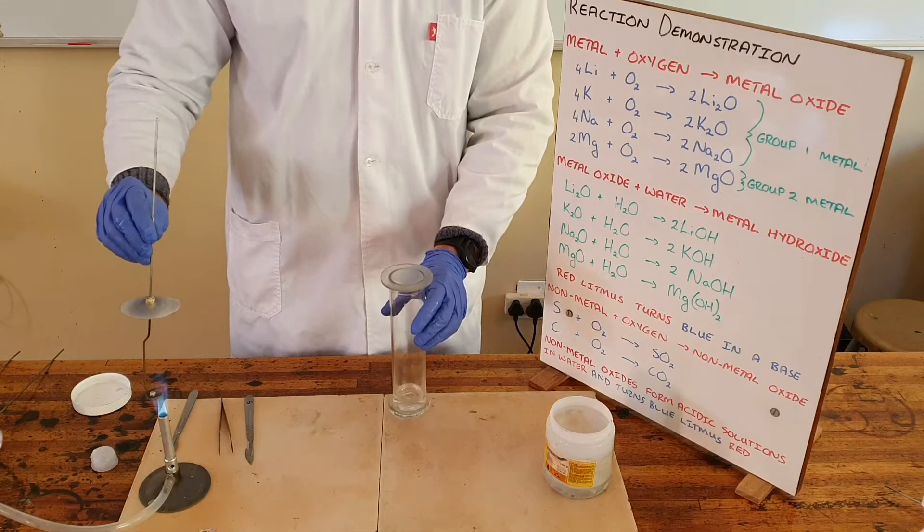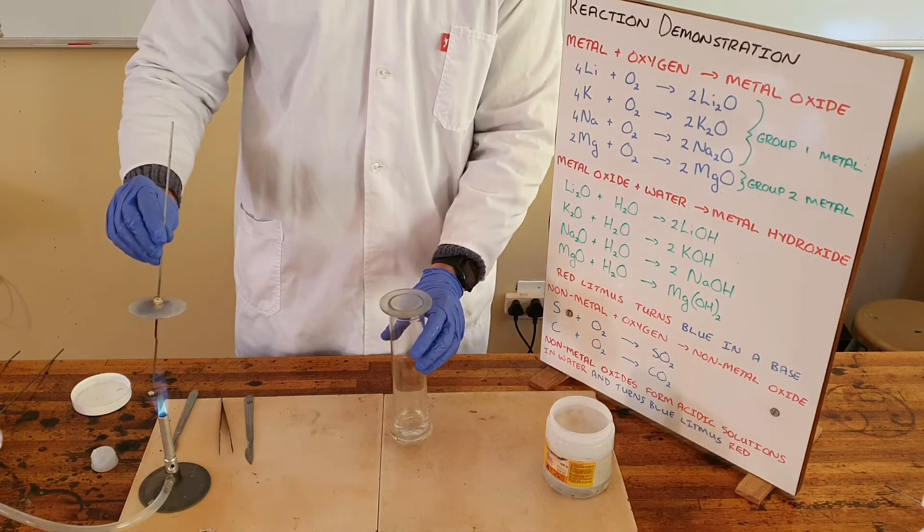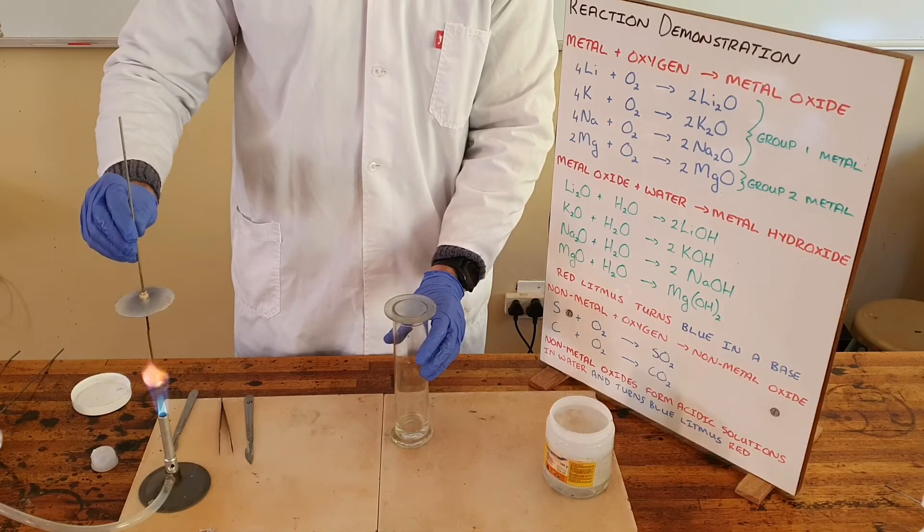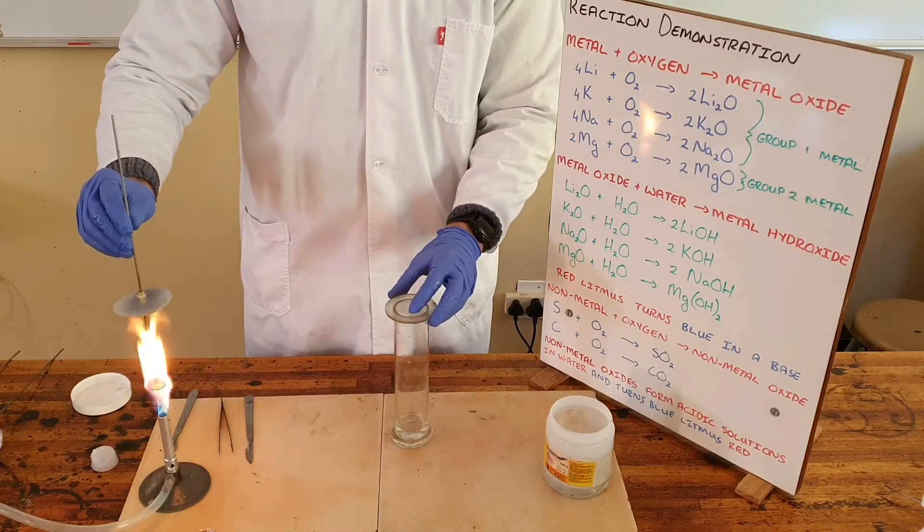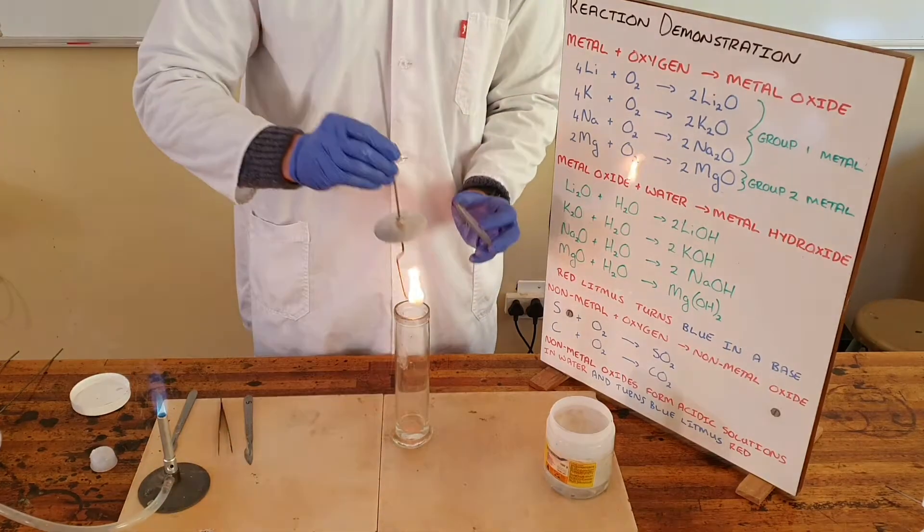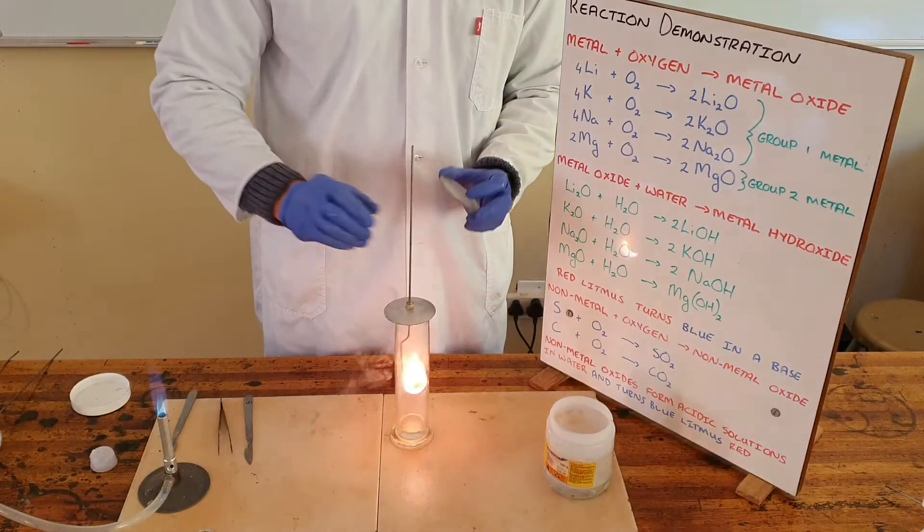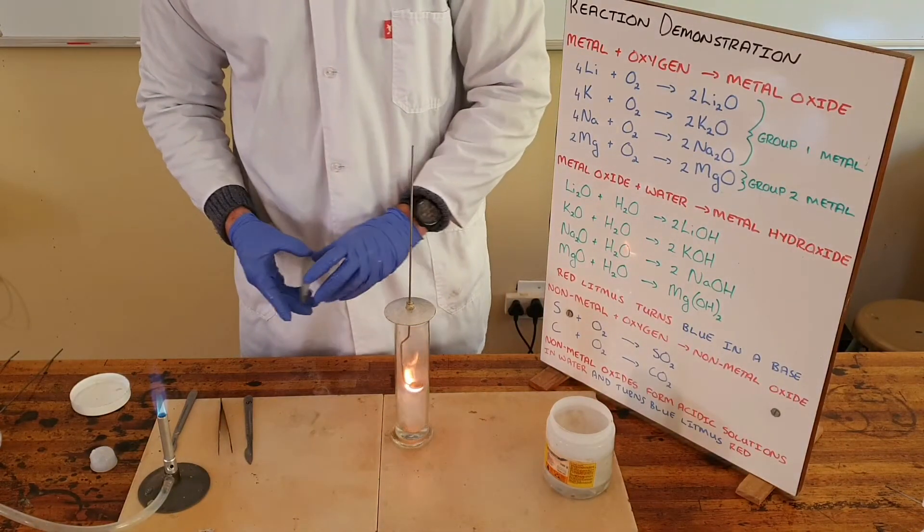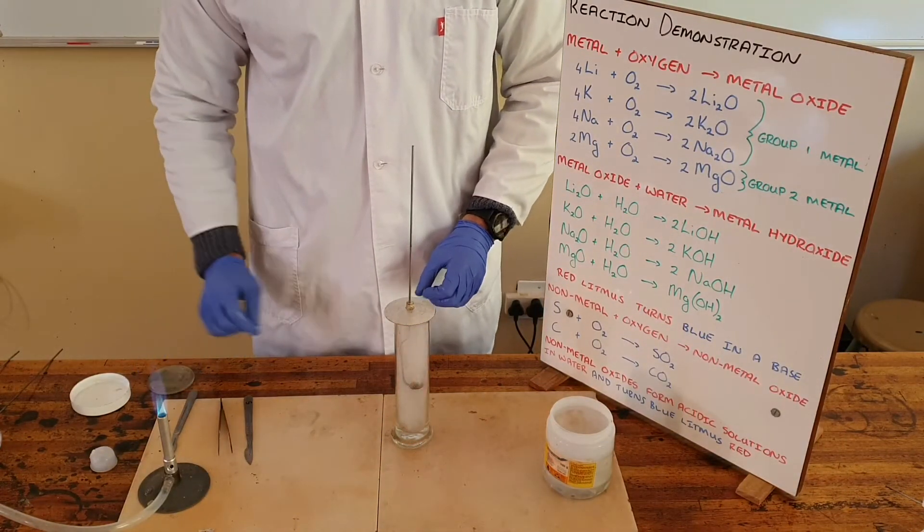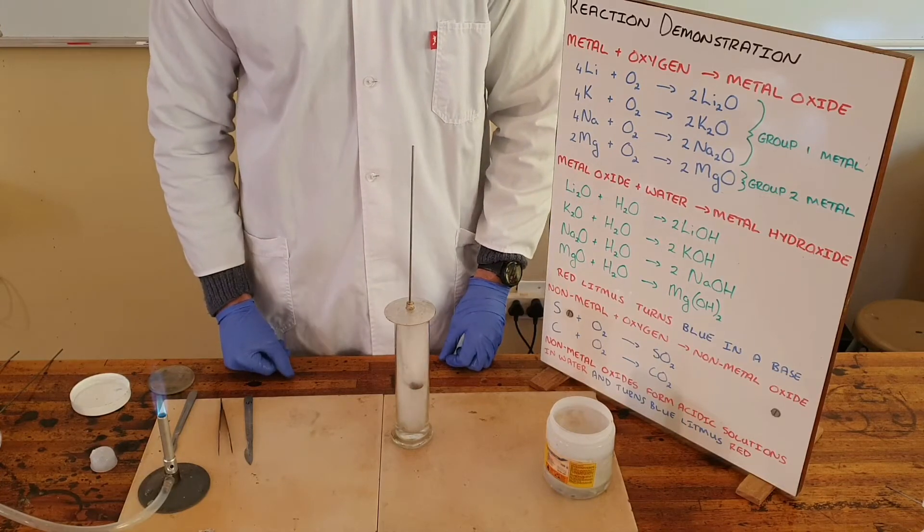The initial yellow-orange flame that we see will be the paraffin as it ignites, and then we can see that the potassium forms a very bright lilac flame when placed in the oxygen.